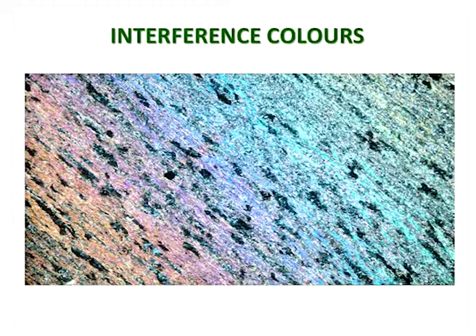So I think we've had a few questions about interference colours. So let's move on to those. Of course, this thin section here, this image shows some beautiful interference colours, and there is a very strong variation across the slide here from the bottom left-hand corner to the top right.